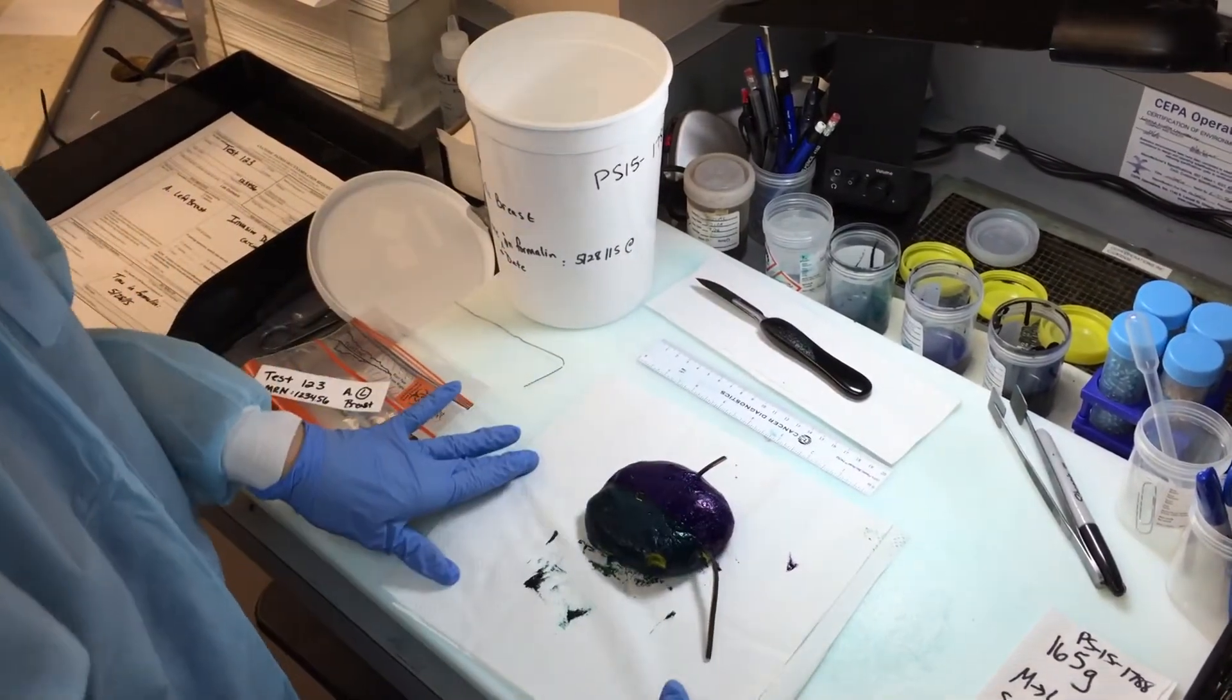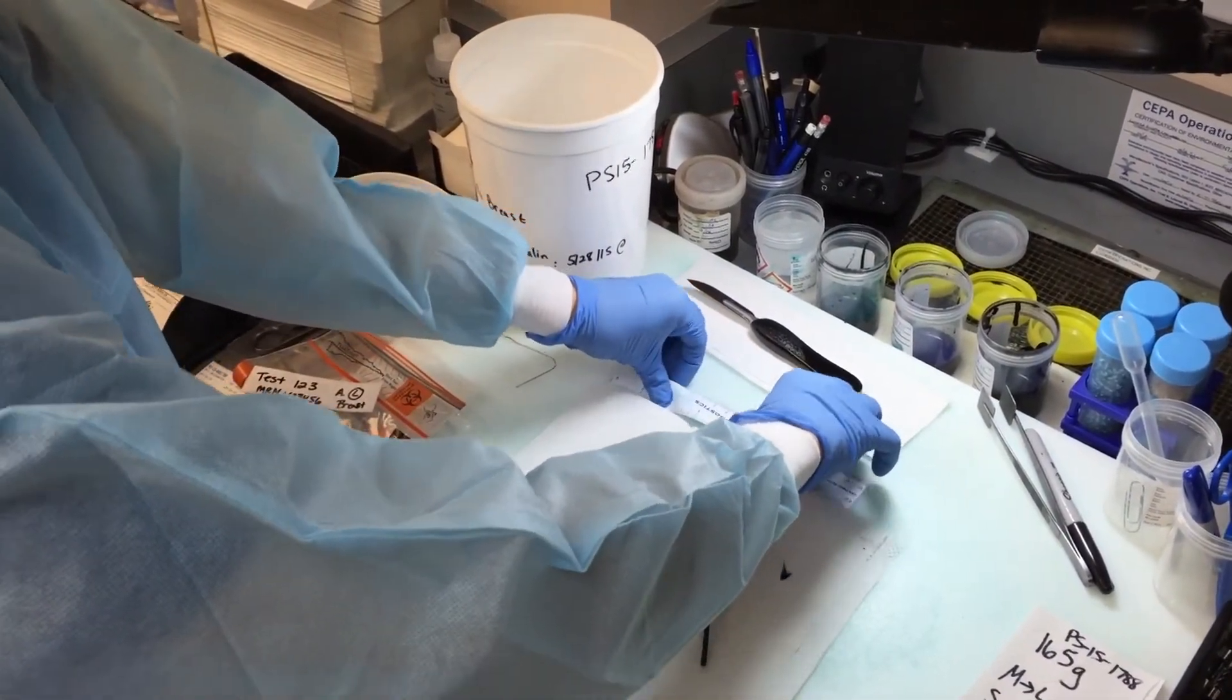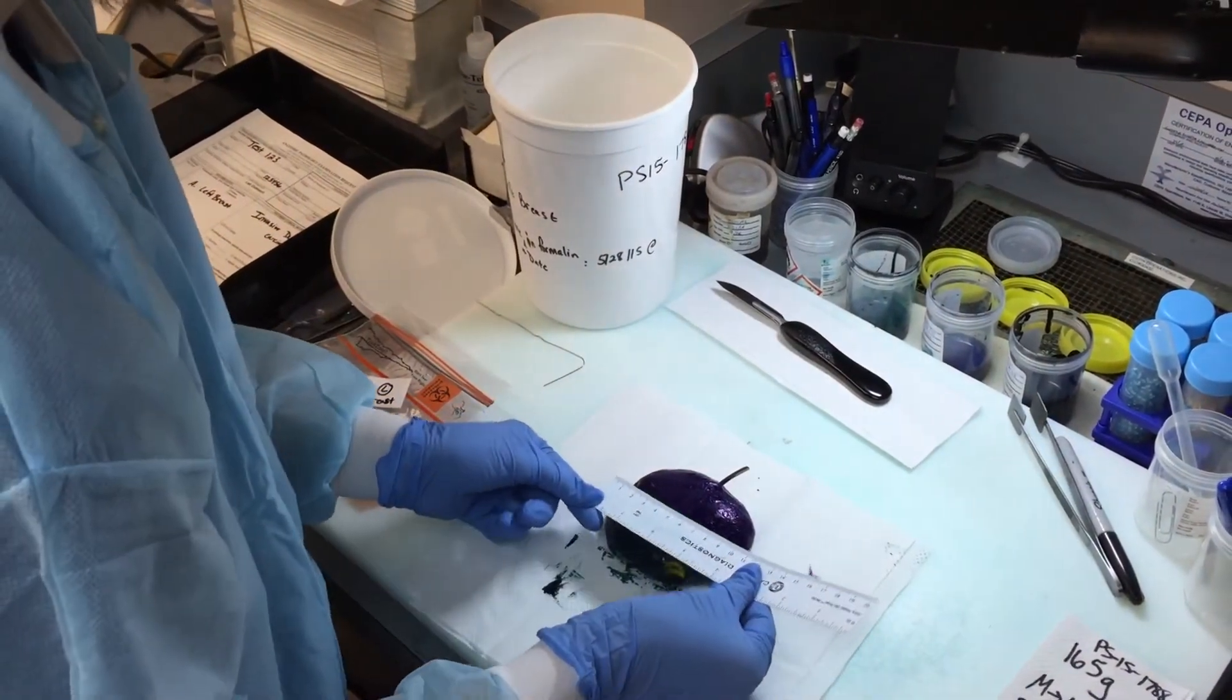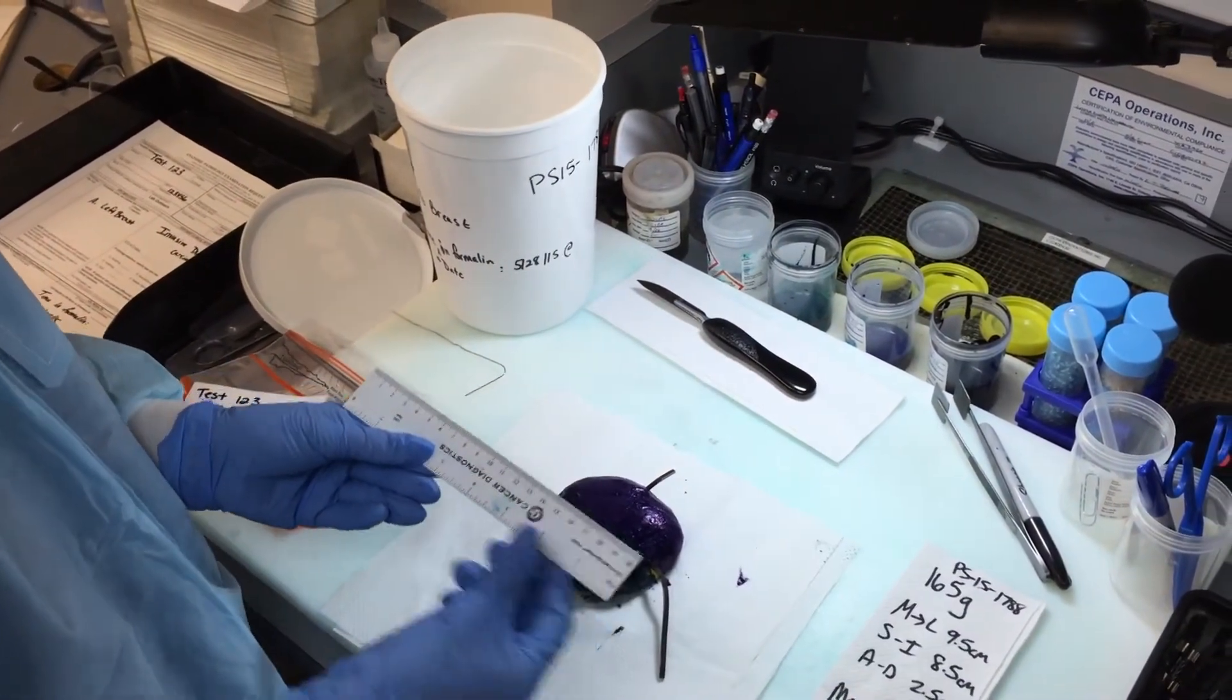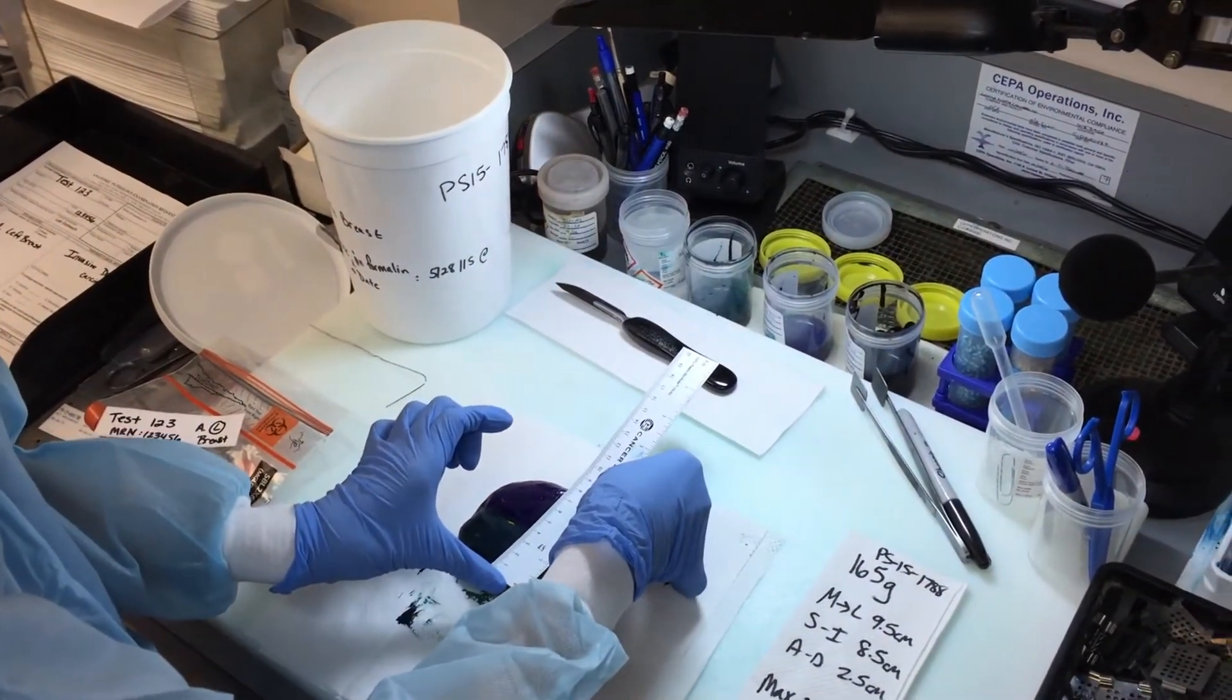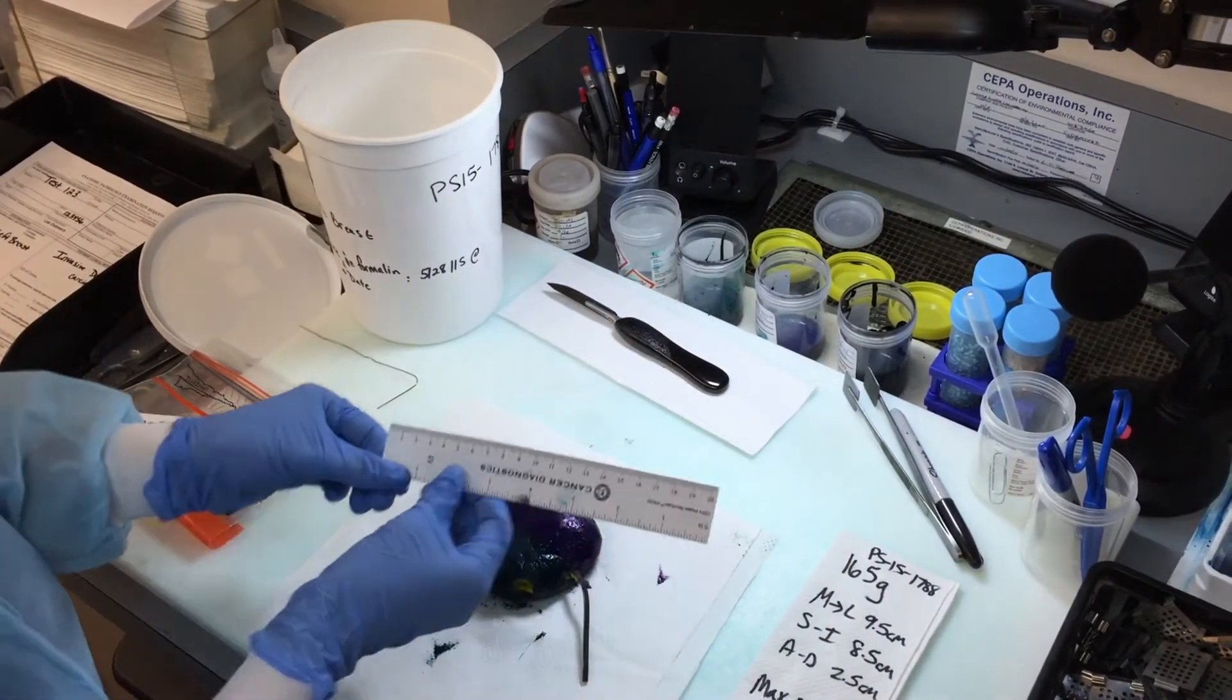And the next thing you want to do is measure the breast tissue. So you always want to measure the longest axis first. So we can see here that the medial to lateral axis is longest. So when we measure that, we measure it at 8.5 centimeters. And on the same paper towel, I keep the notes for dictation tomorrow. The superior to inferior is going to be 8.5, and anterior to deep is going to be 2.5 centimeters.